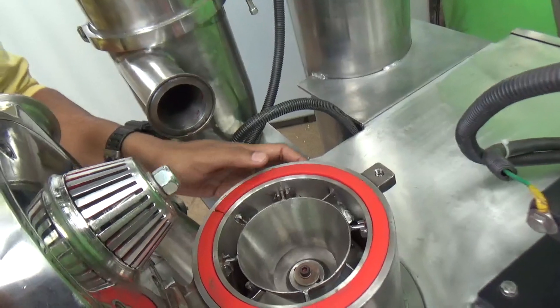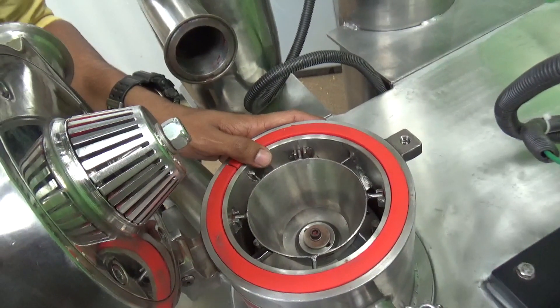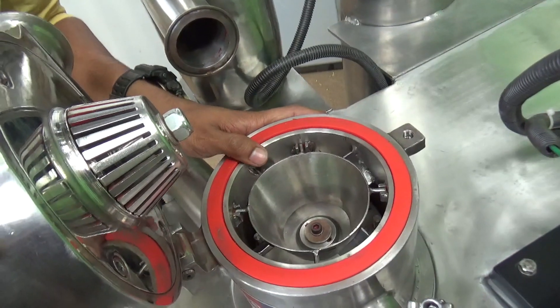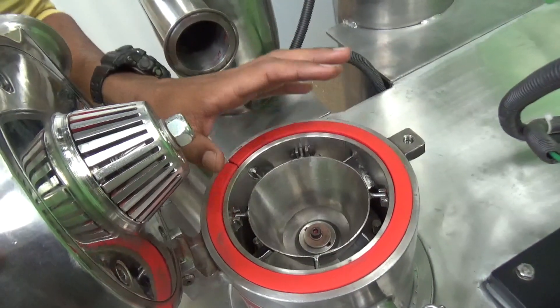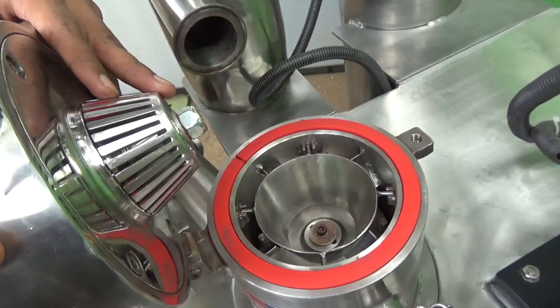This main mill consists of hammers mounted over a disc. The disc can be rotated up to 22,000 RPM. Once the material is ground on these hammers and on this disc, the material is transferred to the classifier.